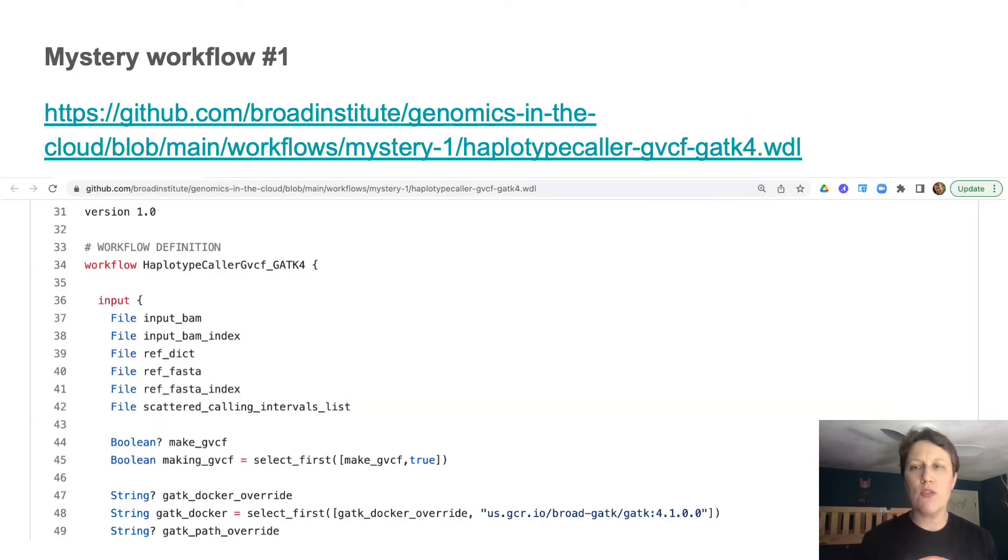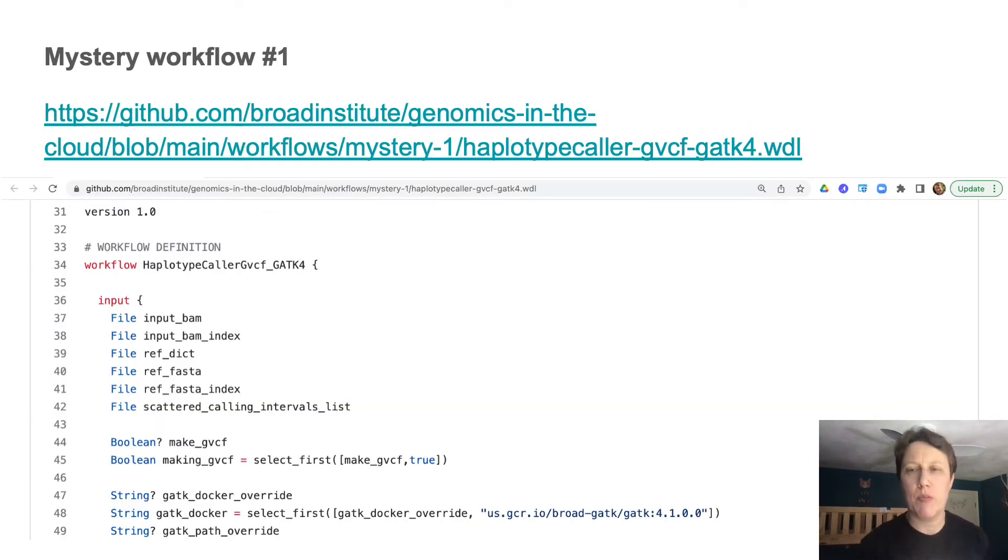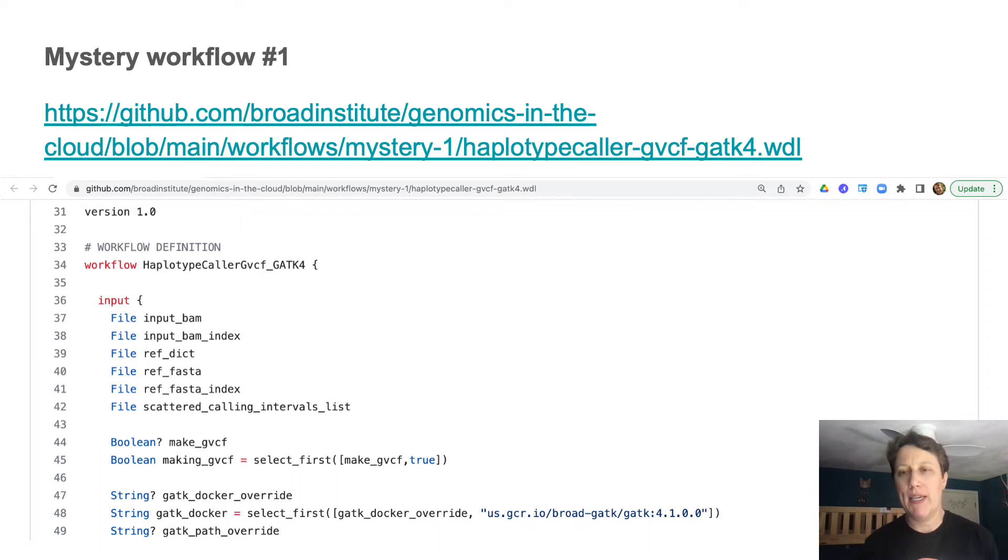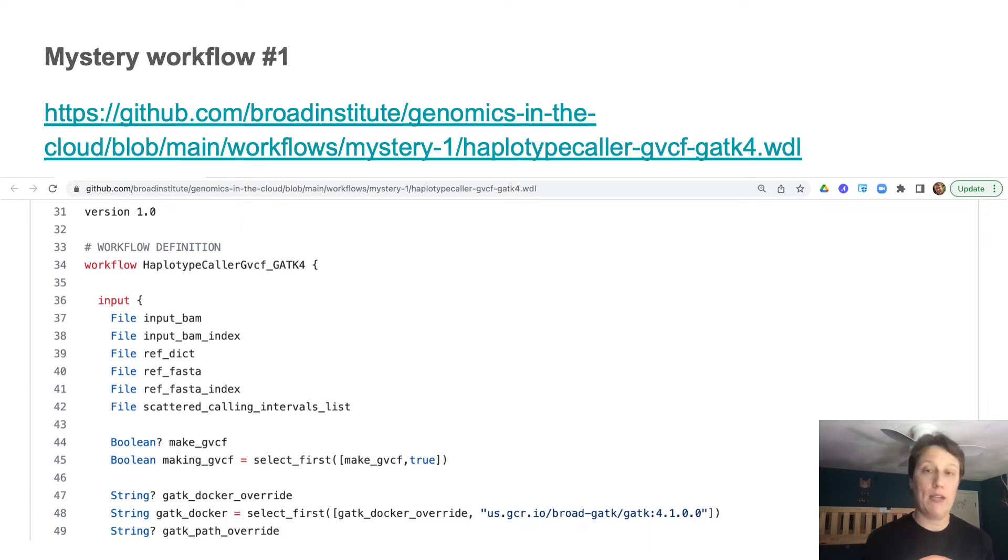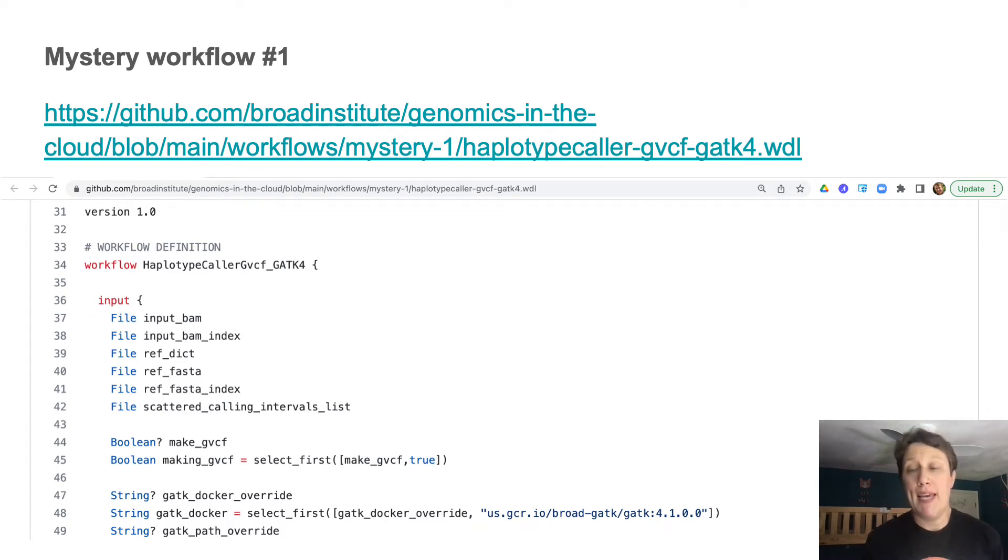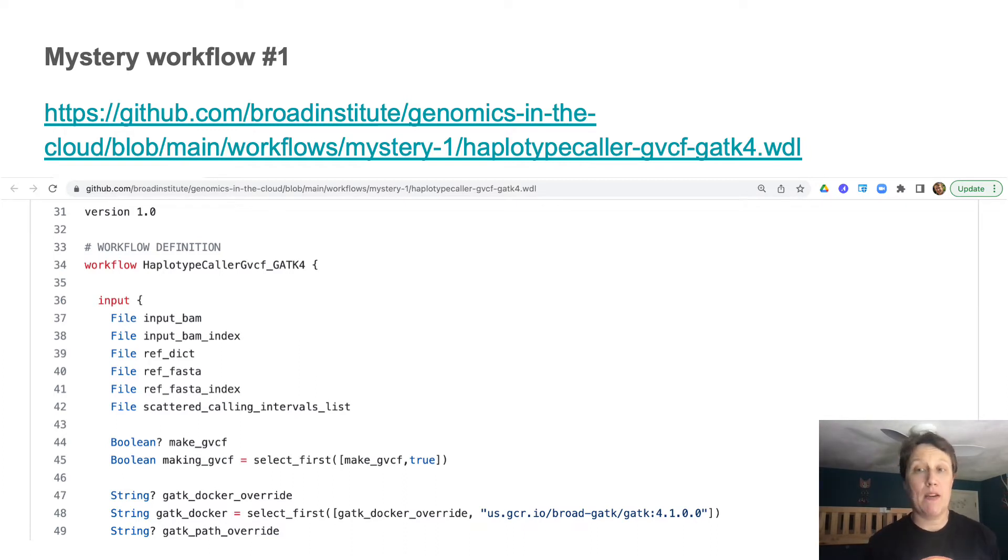So let's assume I'm a new grad student, I'm starting a variant calling project, and a departing postdoc sends me a cryptic Slack message with a GitHub link and the instruction start with this. So okay, let's check it out. And by the way, I'm going to pretend I'm unable to read any documentation lines because sometimes you can't trust those and other times there are just none.